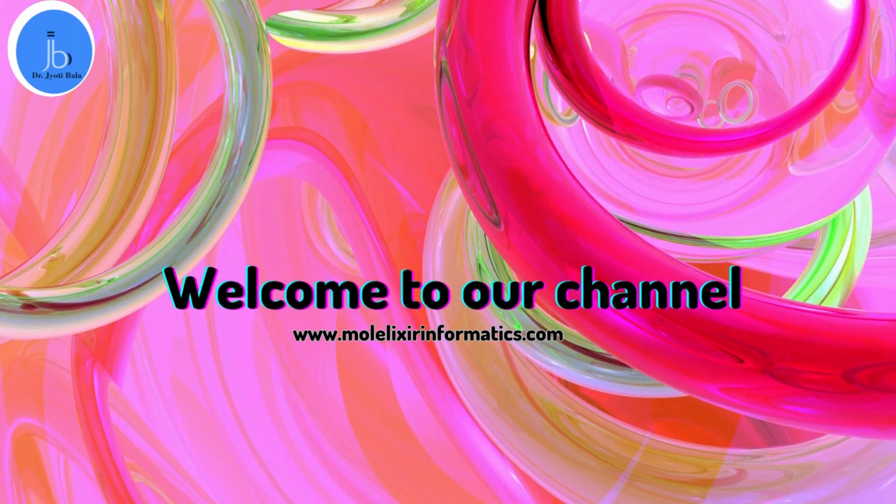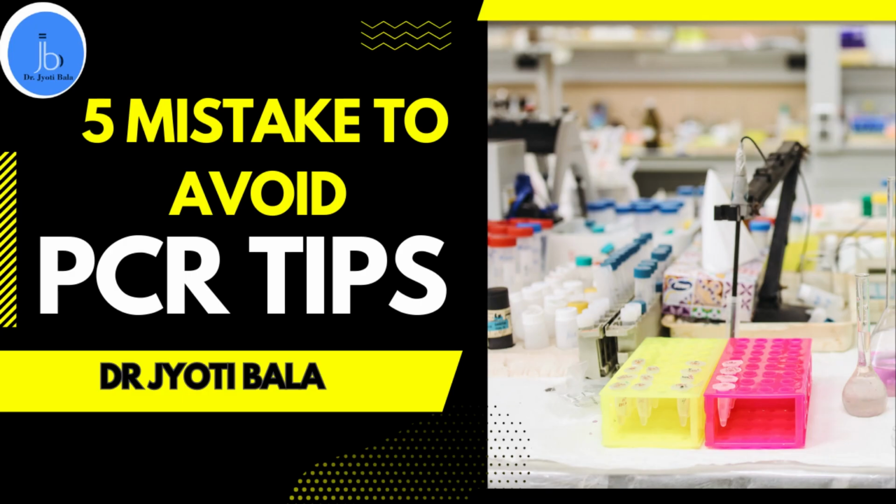Hi everyone. In today's video, we will be sharing with you the 5 common mistakes to avoid during PCR.